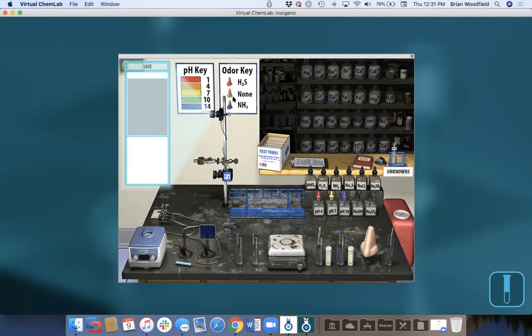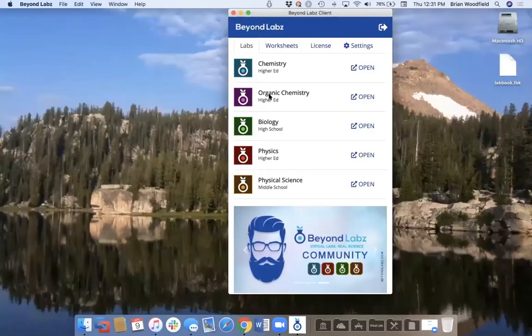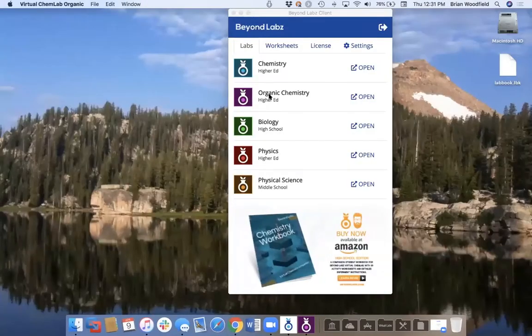All right, are we good with this one? All right, let's go to organic chemistry. So I'm not an organic chemist.